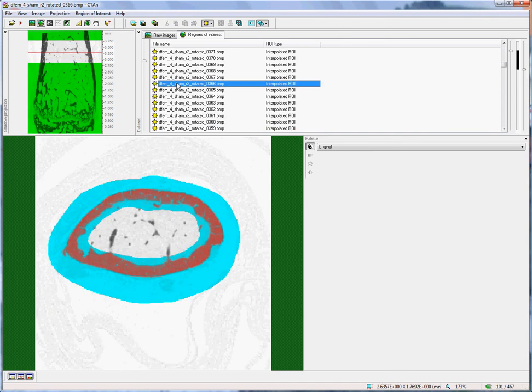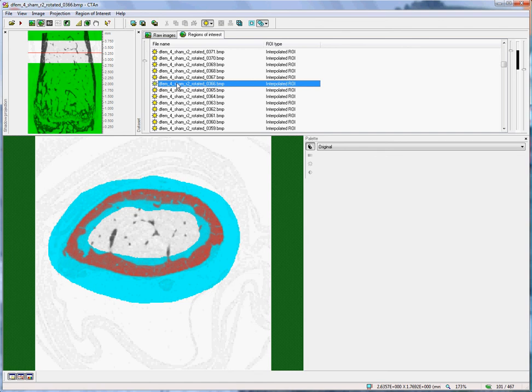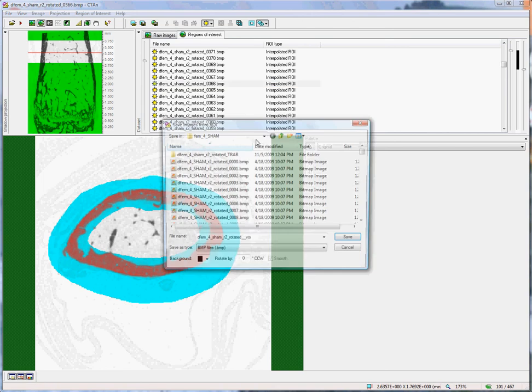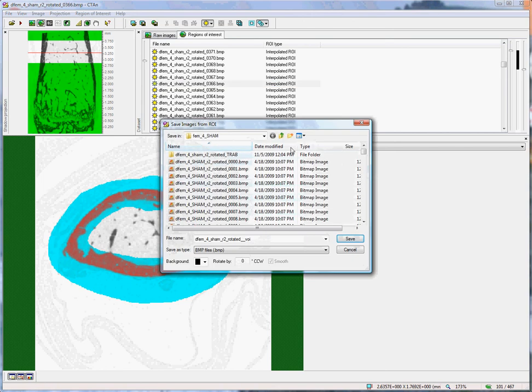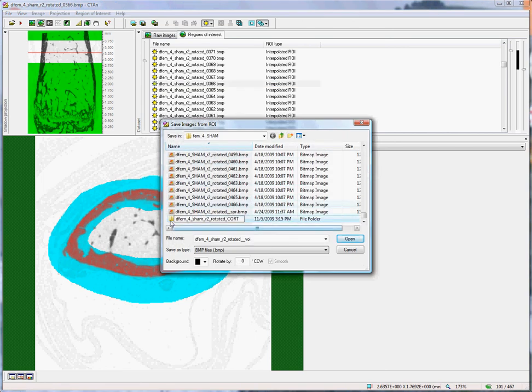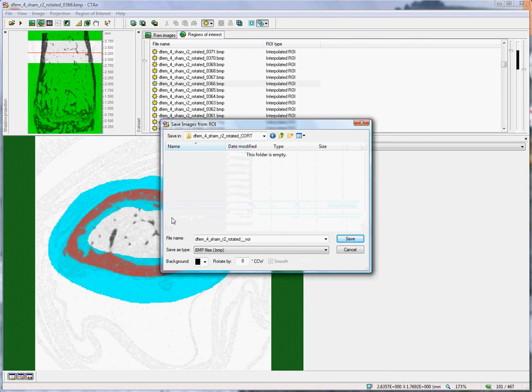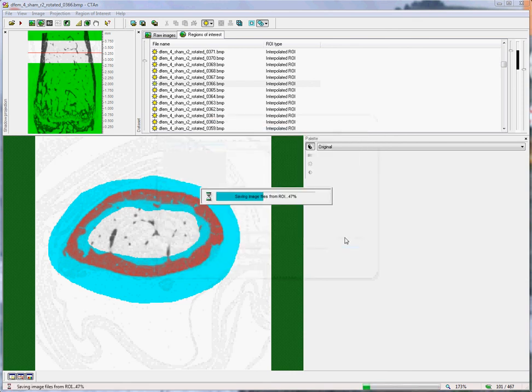And also, importantly, as in the case of trabecular bone, we finish by making the cortical bone volume of interest data set. We do that by clicking on this third button, Save new data set from ROI. New folder, enter the file name, and save.